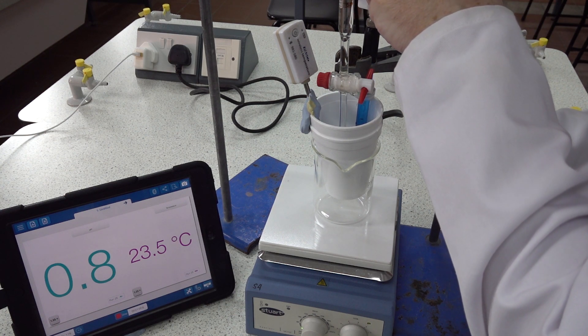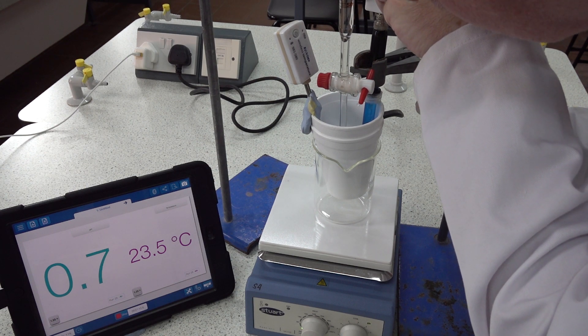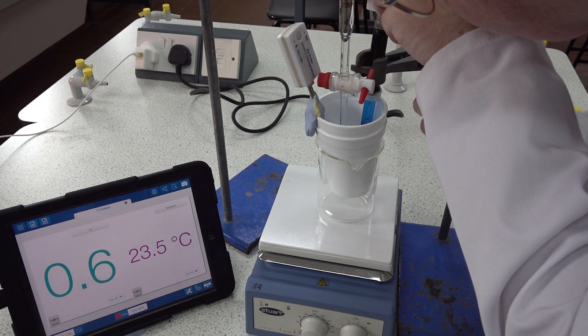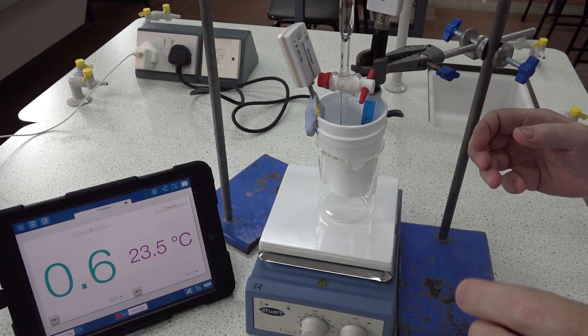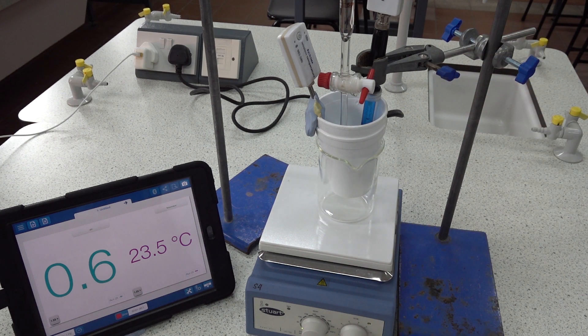Of course the trick is to not allow the stirrer bar to interfere with the pH probe, which could be rather catastrophic. So there we have it — okay, we're now ready to start a run. Those are the conditions at time zero, so we need to record readings after every addition of alkali.